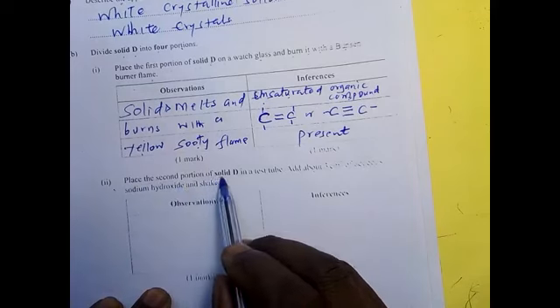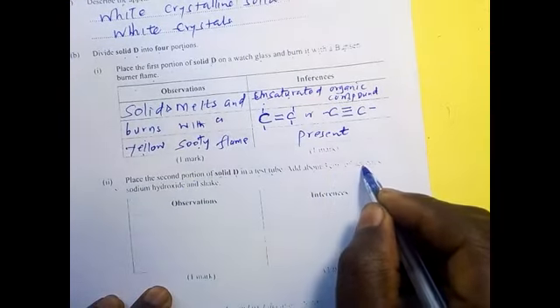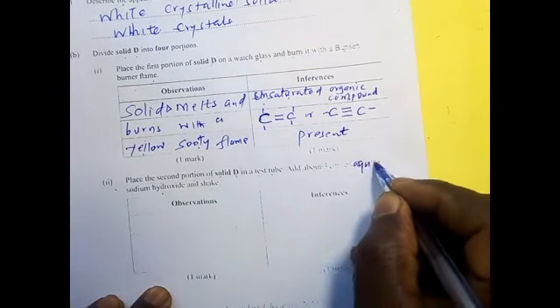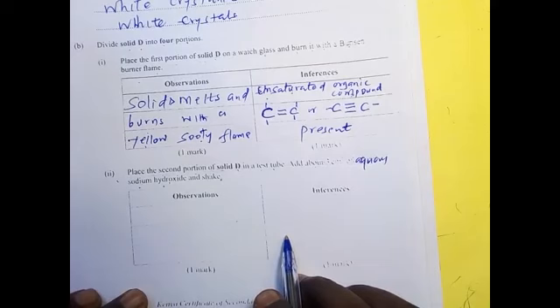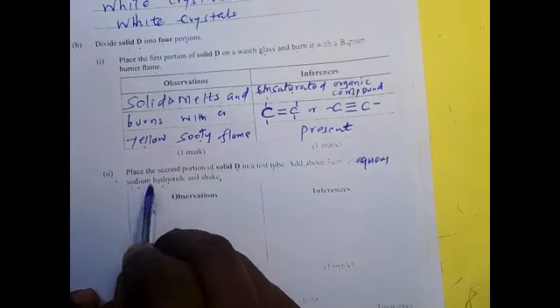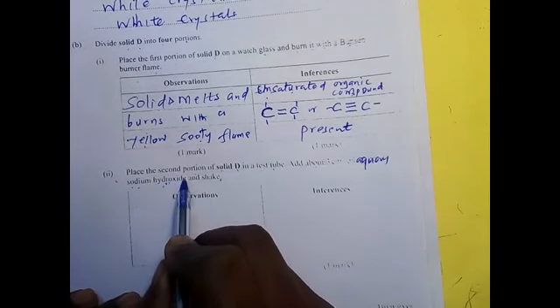Place the second portion of solid D in a test tube. Add about 3 centimeters cube of aqueous sodium hydroxide. Now you see, here we are using aqueous sodium hydroxide. Basically, we want to test whether this organic compound is basic, is neutral, or is an acid. Because if it is an acid, it's going to produce effervescence. That's why we are using a base. We basically want to test whether it is an acid.